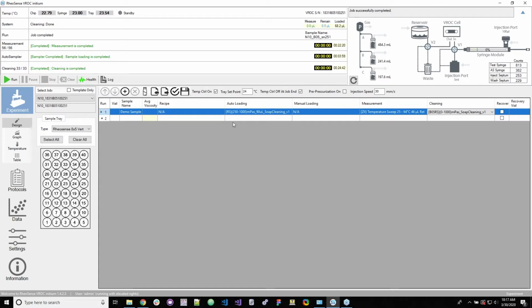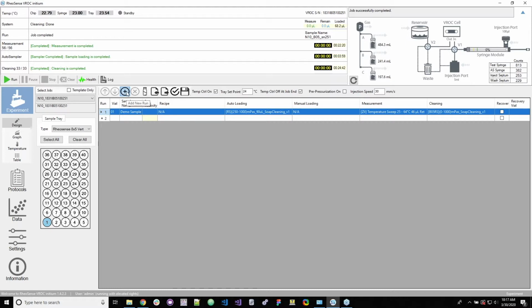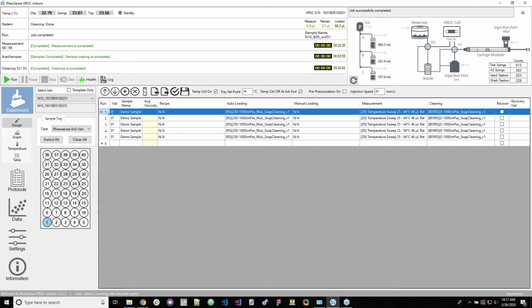All right, and then one final thing, we don't have a vial selected, so we want to come over here and make sure that the vial is selected. If we have multiple samples on the same job that we want to run, just click this, and it will add the same loading and measurement protocol and cleaning protocol for this particular sample. And one thing to note, you notice the vials are still vial 1, but we want them to go from 1 to 5. So to do that, we have up here on this tab the auto assign vials. If we click that, it asks, do you want to assign vials automatically? Yes. And now it is populated 1 through 5.